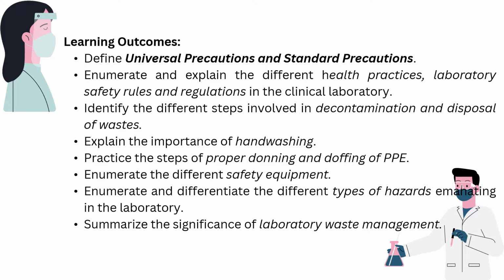At the end of this lecture, we will be able to define the difference between universal precautions and standard precautions. We'll also be able to enumerate and explain the different health practices and the laboratory safety rules and regulations in the clinical laboratory, specifically the clinical chemistry laboratory.